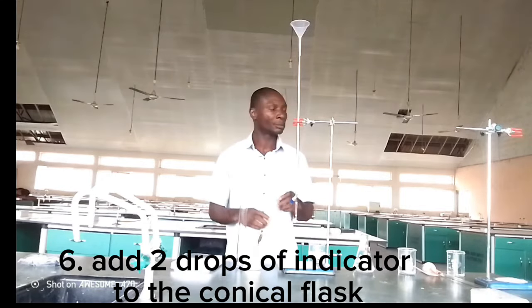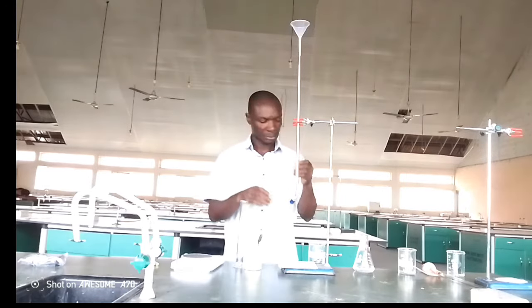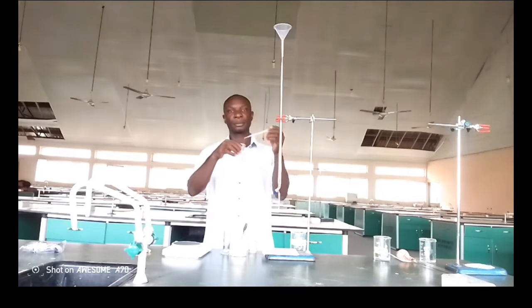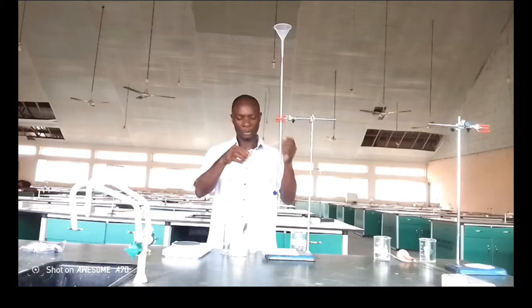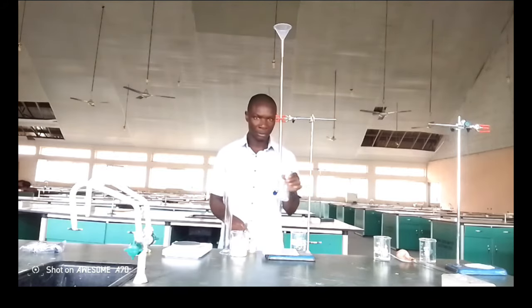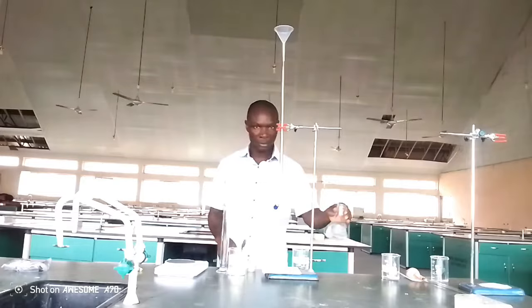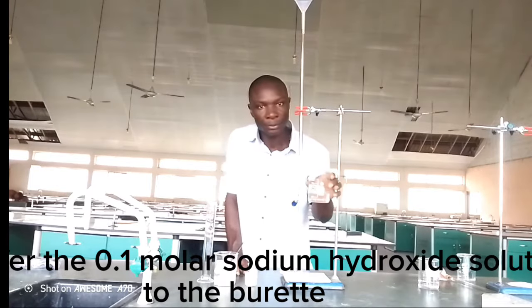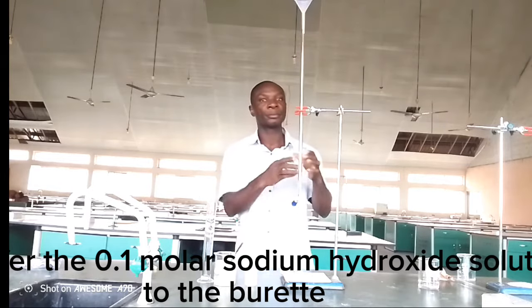6. Add 2 drops of indicator to the conical flask. 7. Transfer the 0.1 molar sodium hydroxide solution to the burette.